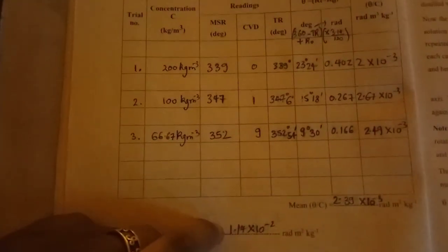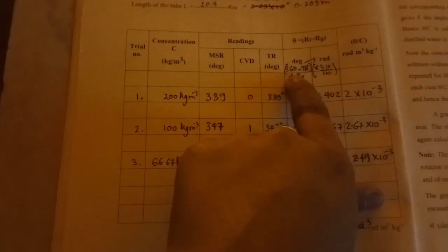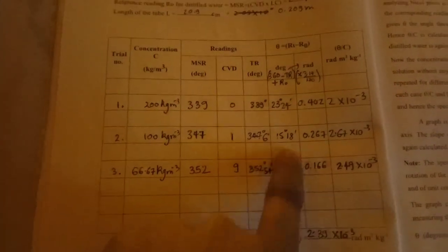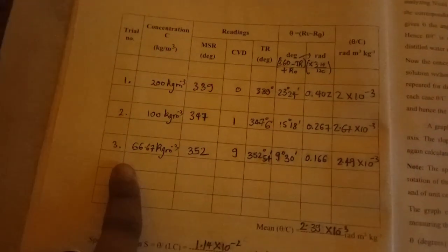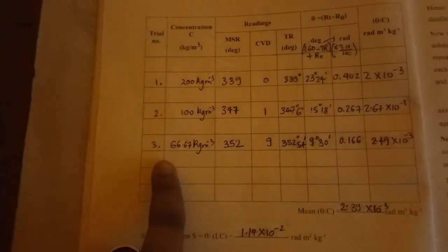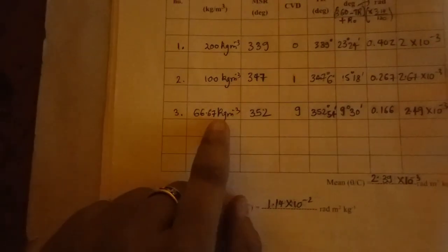Likewise for the next trial that we'll be taking. So when you get equal intensities, once again note down the degree value. Find R1 minus R0 by subtracting 360 minus this total reading and then adding R0. So once that's done, convert it to radians as usual and repeat it. Once again you'll have to dilute it, and this time it will be 66.7 kg per meter cube. I'll explain how the concentration is found.